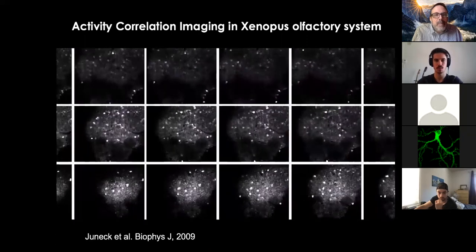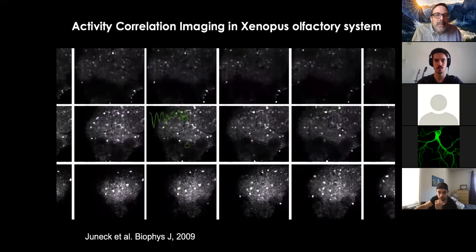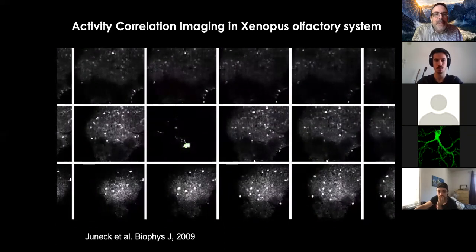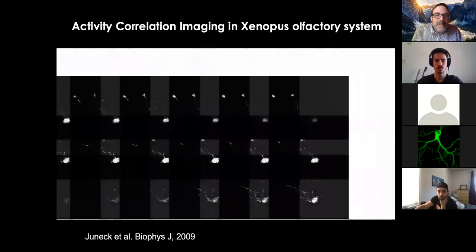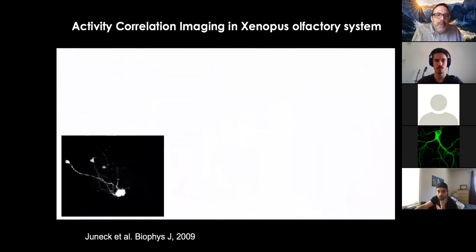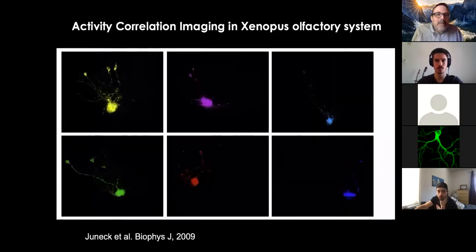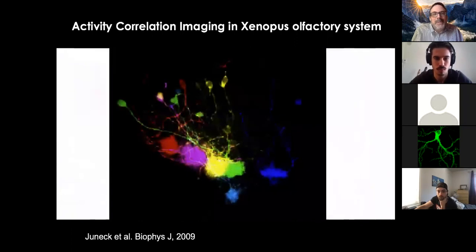So this is a video. This is again the olfactory bulb in Xenopus. We pick one site, look at the calcium activity, and then do a correlation map throughout the entire structure, and you can get images like this. Then you pick different glomeruli, different sites, and altogether you're able to identify different inputs to identified structures. These are still pretty small structures, like 40, 50 micron diameter structures in the brain. So this is super cool. We've tried a lot to get this to work, and it's not so easy to get high signal to noise, but I think this is worth investigating further.